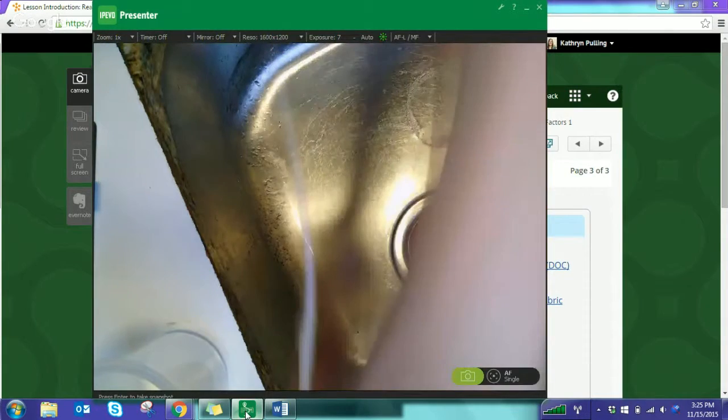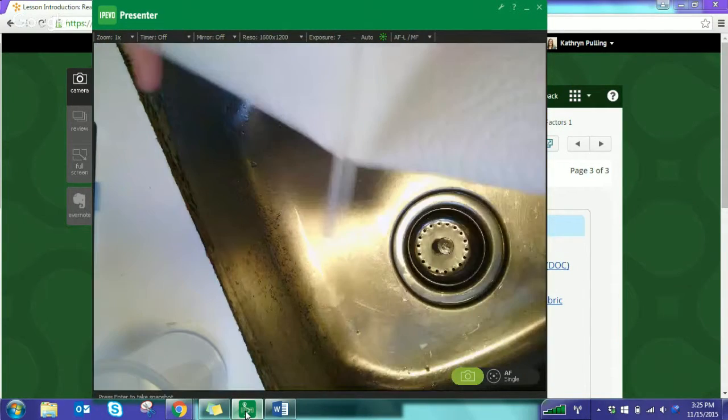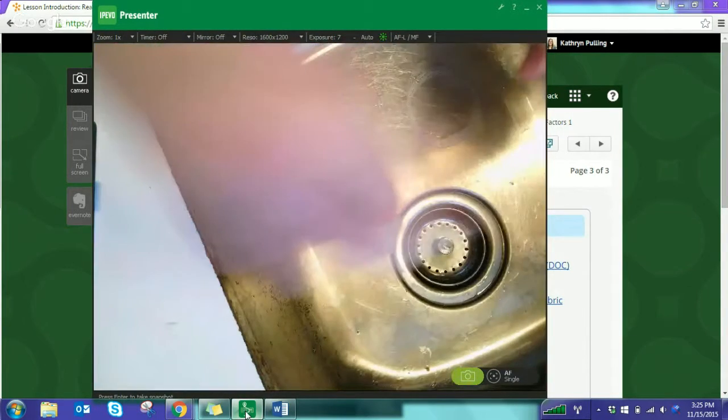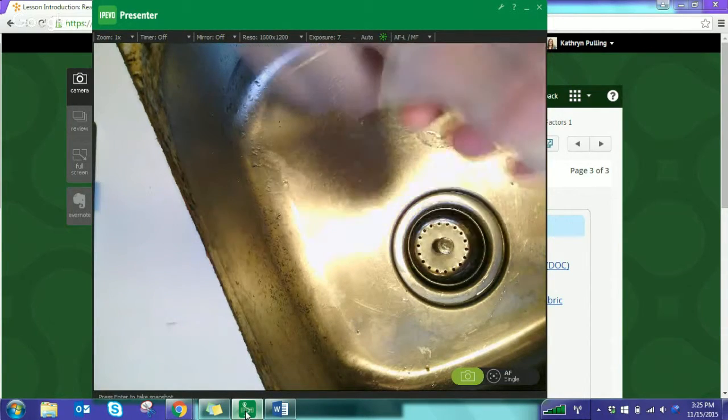And then as one more precaution, I'm using tap water here, so I don't want any of the dissolved solids in the tap water. I'm going to dry everything off. So there's my stirring rod, dry off the beaker, and now I can move on to part 2.